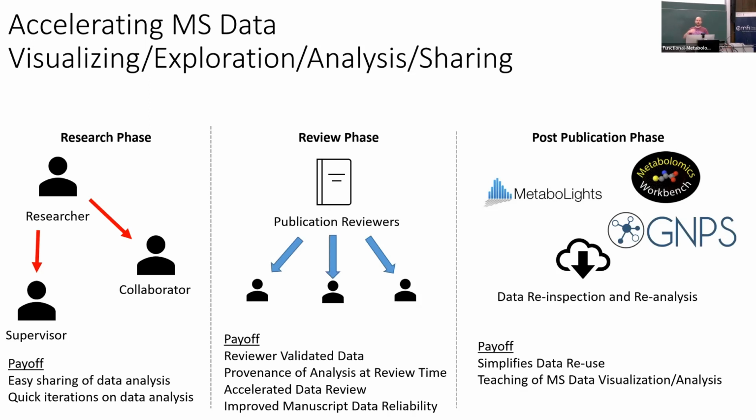And then hopefully in the long run, that allows people to check on your data, verify your findings, and perhaps also reuse some of your data, because once you have it already in your web browser, then you think, oh, maybe that's interesting for me too. Let's click a little bit around and maybe launch some new analysis with it.